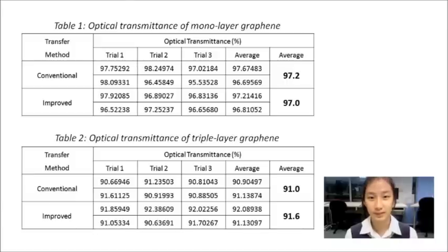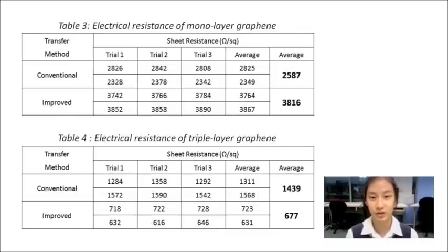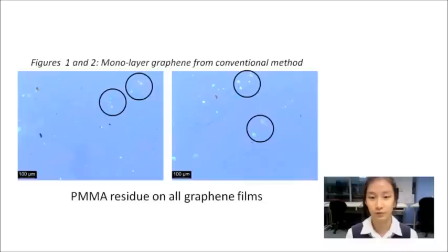The optical transmittance of monolayer graphene prepared by both methods is 97%, while the optical transmittance for triple-layer graphene is 91 to 92%. This shows that the improved method does not increase optical transmittance. The electrical resistance of monolayer graphene is generally higher than the electrical resistance of triple-layer graphene. This may be because defects in one film can be bridged by its neighboring films in triple-layer graphene, thus decreasing resistance. The improved method increases electrical resistance of monolayer graphene because the 2 coatings of PMMA take more time to dissolve than a single coating, resulting in many spots of PMMA residue on the graphene films.